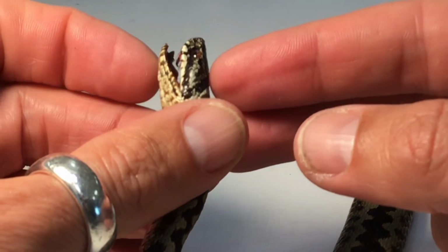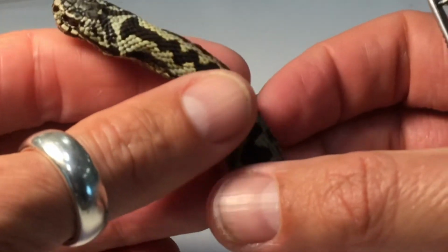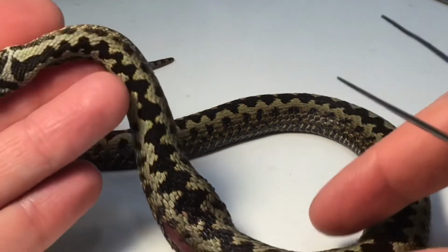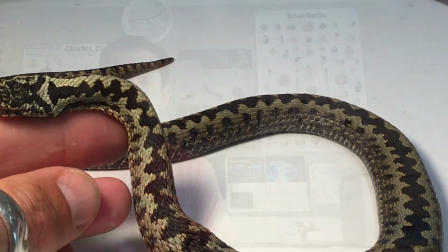So this beautiful little male adder unfortunately met his demise under the wheels of a vehicle. But it does provide a nice opportunity for us to observe the specimen very close at hand, and I'm going to try and preserve him for posterity. So here it is. This is my first wet specimen. I'm quite pleased with how it turned out.